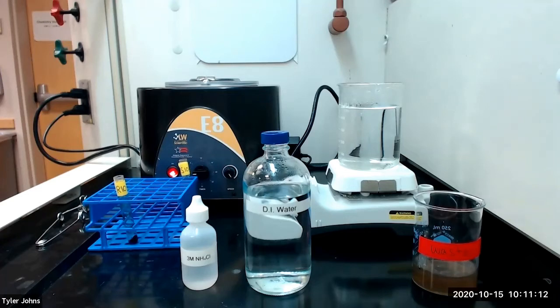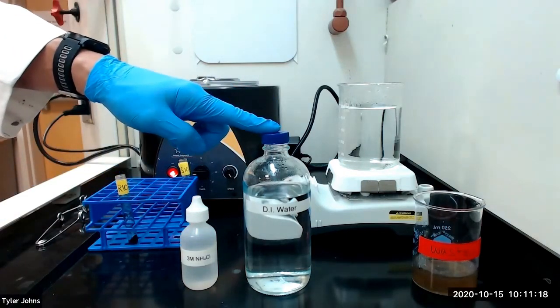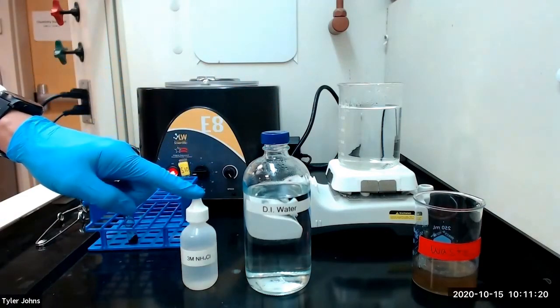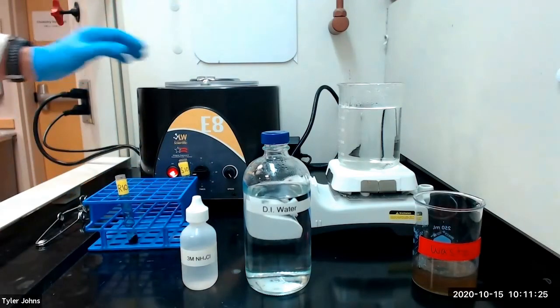We will now perform the test for zinc ion. To begin, we will wash residue R10 with 5 milliliters of deionized water and two drops of 3 molar ammonium chloride. We will then mix, centrifuge, and discard the wash.